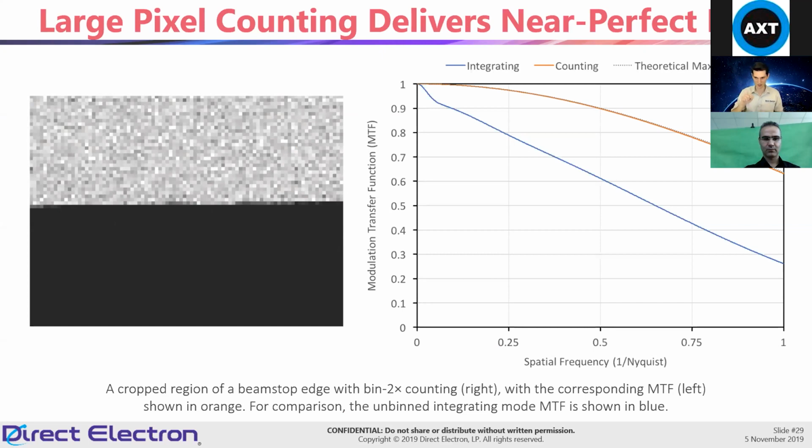And so this is where you basically see MTF differences. This is a hard edge, and there's a complete difference between no signal and signal. And as it goes across the pixels, you can see that the signal goes down when there's a little bit of it obscured.